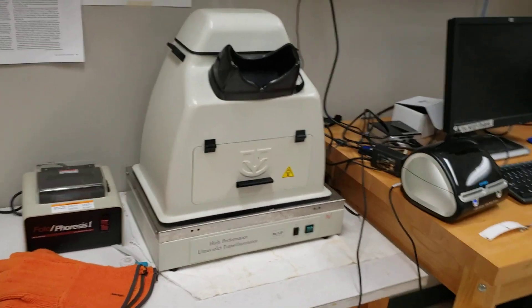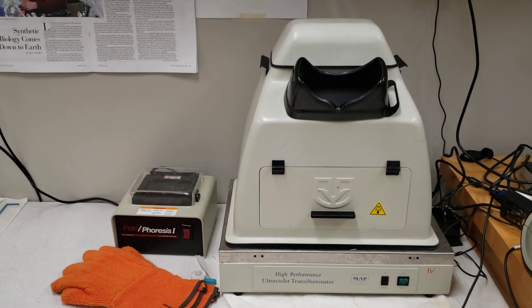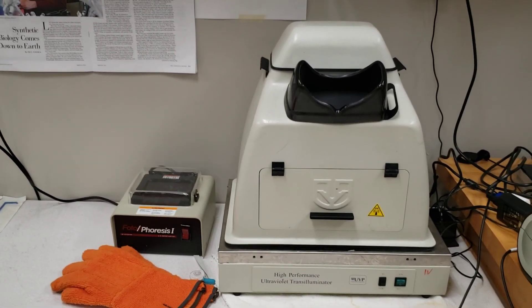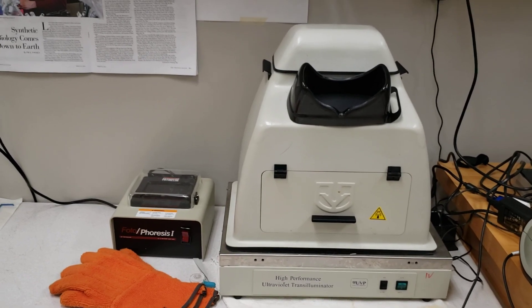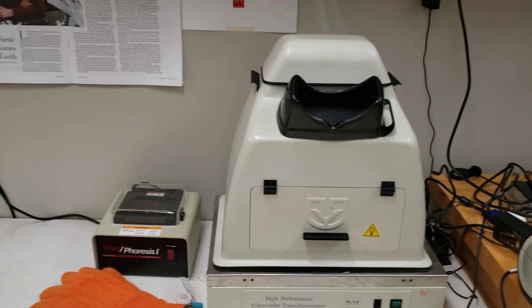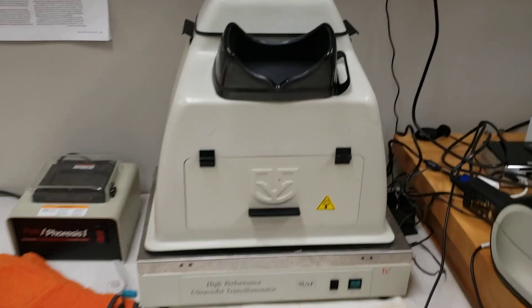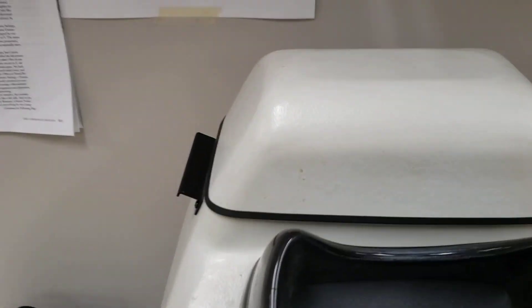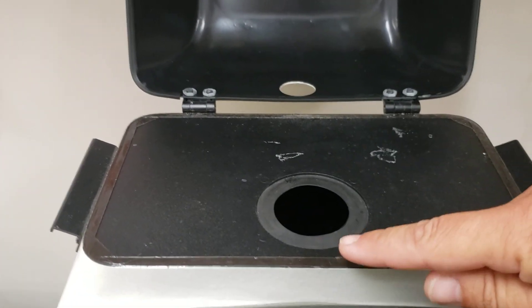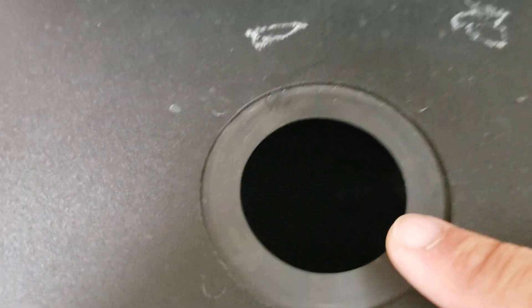Here's my UV transilluminator — it's about the only real dangerous piece of equipment we still use in the lab. We no longer use ethidium bromide; we use gel green. However, I get really good pictures with my UV viz. I have a shroud that used to have a Polaroid camera attached on top. Students open the lid, put the gels in, and where the Polaroid camera used to be, they can now set their phone or camera right there on top and take nice gel images without looking directly into the UV.